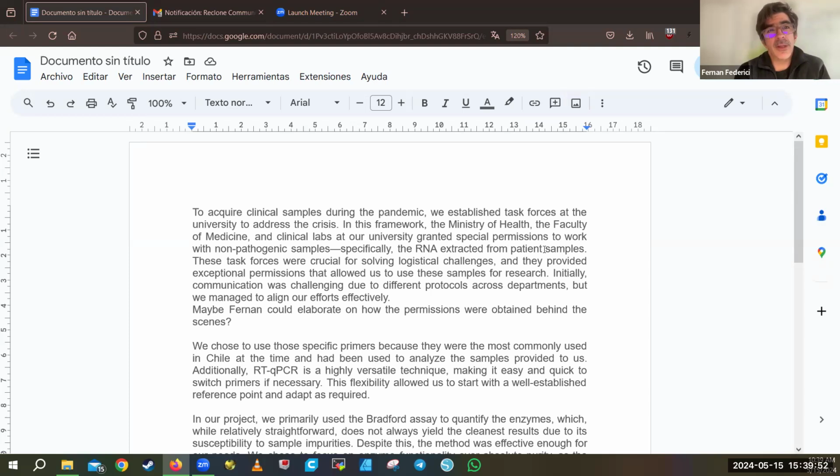And then in the second project, we use this a lot for education. We combine all these reagents with open hardware designed by our group and by other groups, like the qPCR, the GMO detective, and the lyophilization method, so we can implement practical hands-on teaching in different courses that before was, again, prohibitively expensive due to the cost of these reagents.